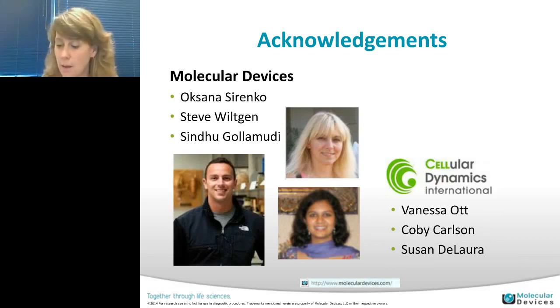And okay, so to resolve the small objects, also in MetaExpress software, when you're acquiring, it is a wide field imager. The images I showed you were done with our wide field imager, but in the software you can do digital confocal, so there's a software algorithm that will help you bring out dim or small objects in your image. And then once you have the images, there are image processing steps that you can take to further enhance your objects of interest.